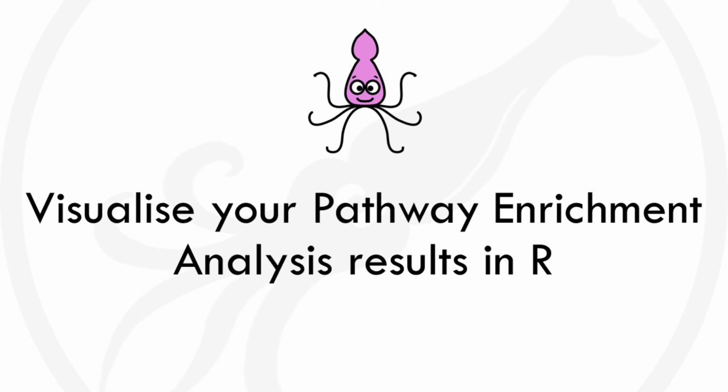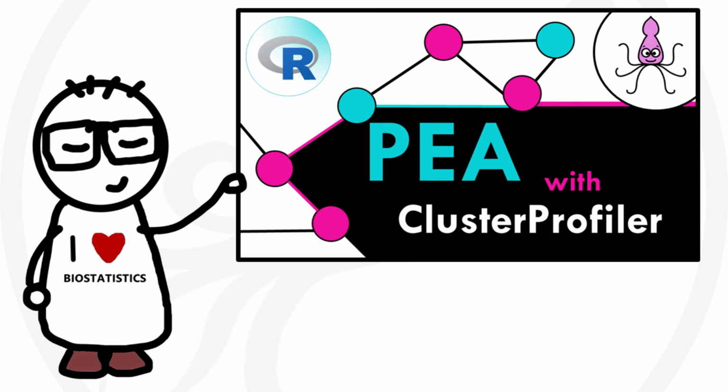This is a continuation of my first video on performing pathway enrichment analysis with clusterProfiler, so if you haven't yet, check it out. And if you perform pathway enrichment analysis with a different tool or package, don't worry, this tutorial will still be useful. Just make sure your starting data frame has all the columns we need for our plots.